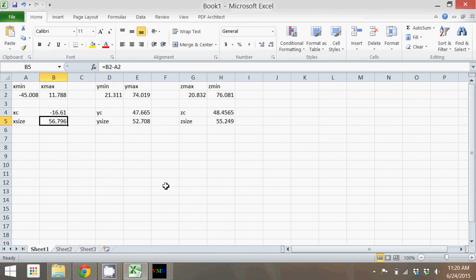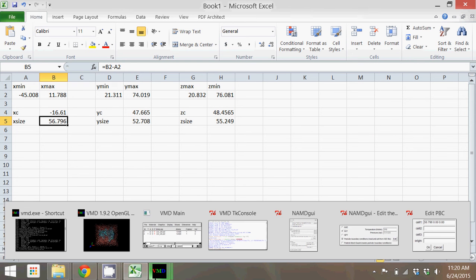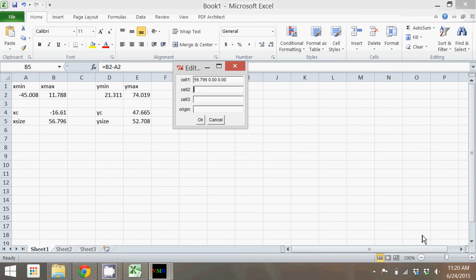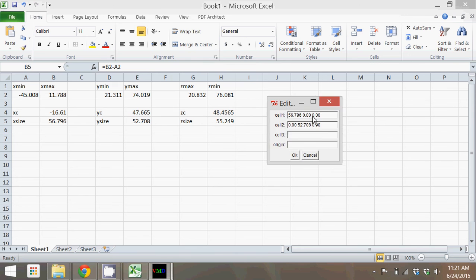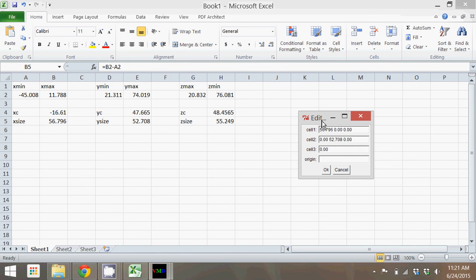Since that's the Y direction, we actually need to put a 0 for the X direction and a 0 at the end for the Z direction. Finally, we'll put in the Z, and so we need 0 for the X, 0 for the Y, and 55.249 for the Z.